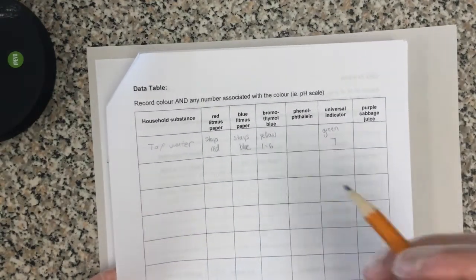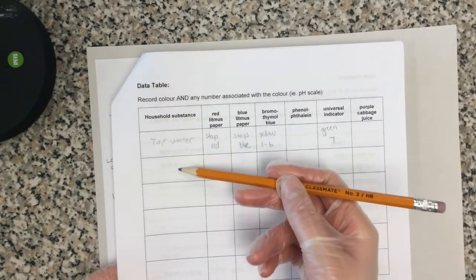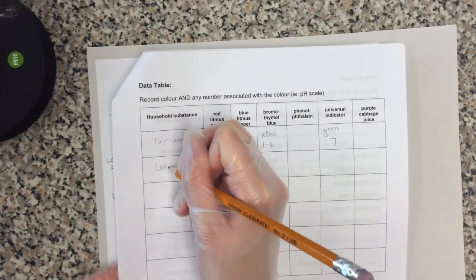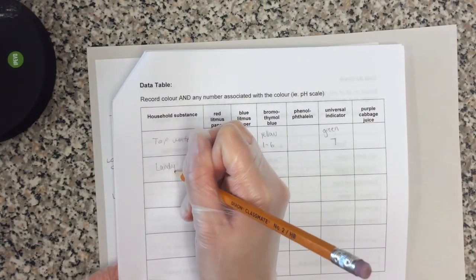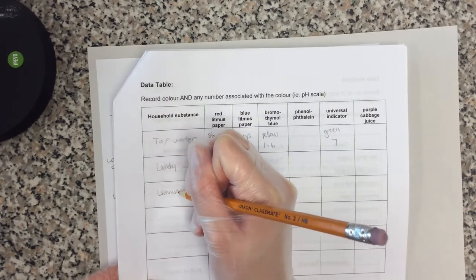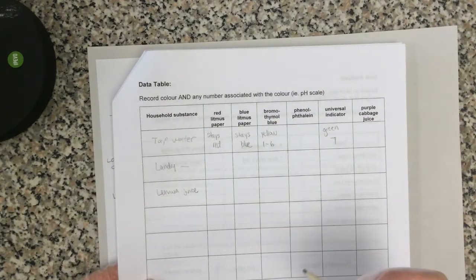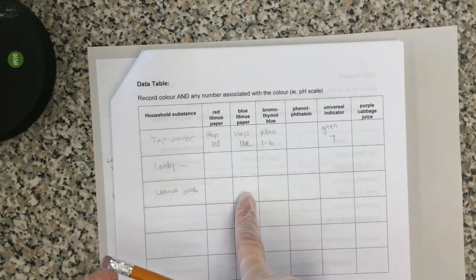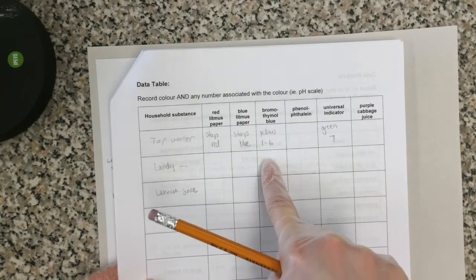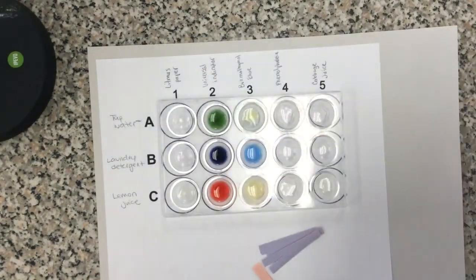Okay. So you should be following along. At this point, you should have your 2 other substances filled in, your laundry detergent and your lemon juice. You should have your red and blue litmus paper recorded, your universal indicator recorded, and now your bromothymol blue indicated. Okay.